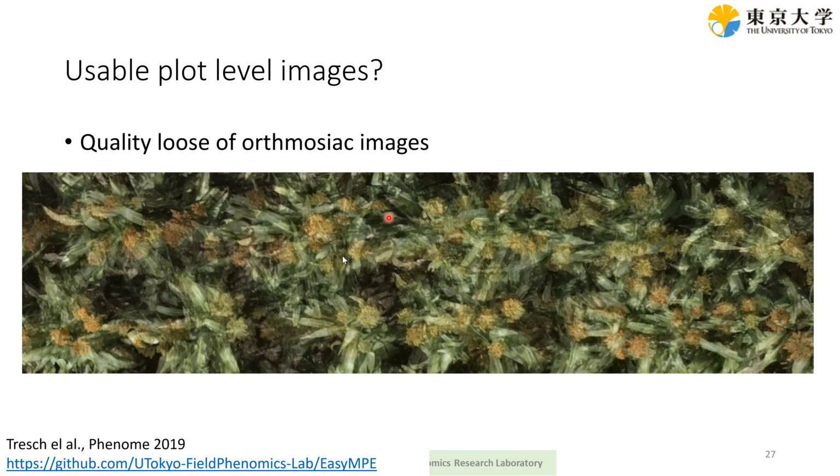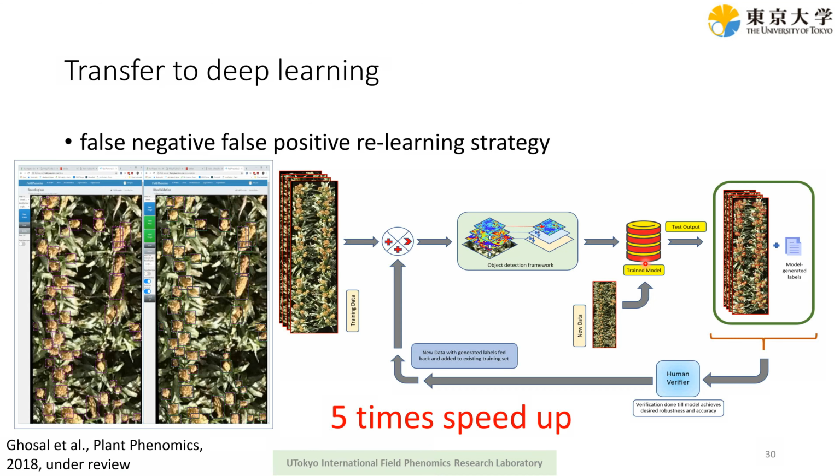I was actually quite fond of this relearning tool that is web-based. You can simply have the human in the loop to give feedback on the first version of your deep learning network. Is this going to be generalized for the public, or are you going to put that somewhere so others can also use the same approach? Oh, this is a very good question.